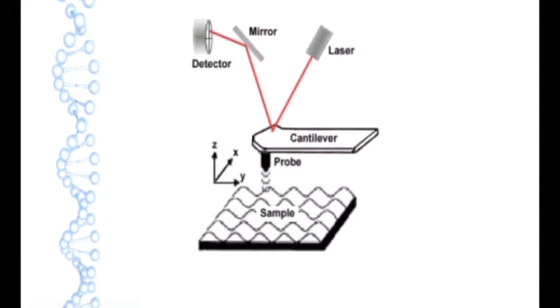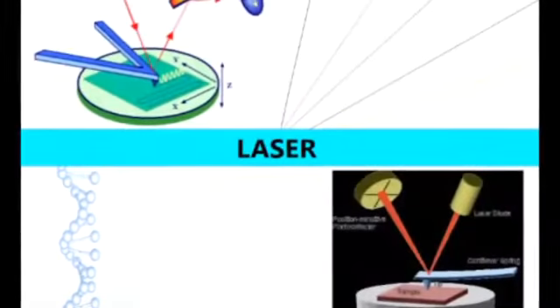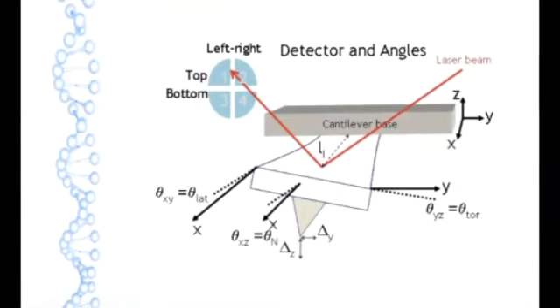The laser is actually the main component since it records the tip's movements to make this topographic map. So whenever the tip moves, the laser moves and the reflection also moves. This is how we record the data. There are lots of different measurements which can be taken to gather characteristics of small materials, including images at different speeds, different angles, and different forces, which also relay different adhesion characteristics.